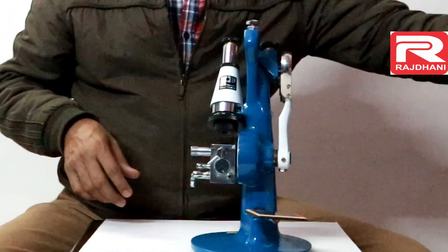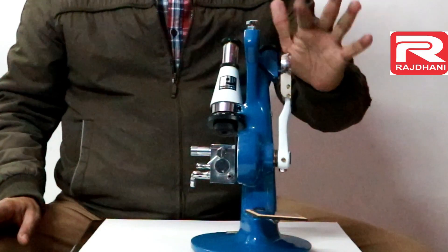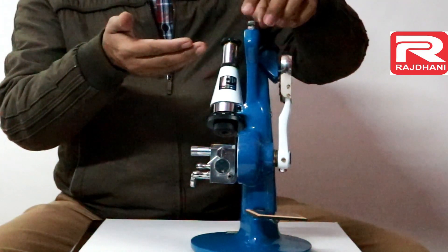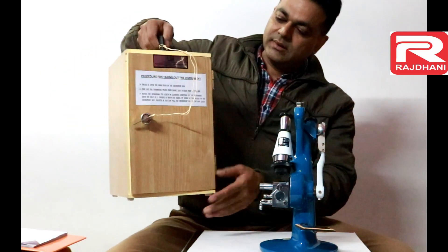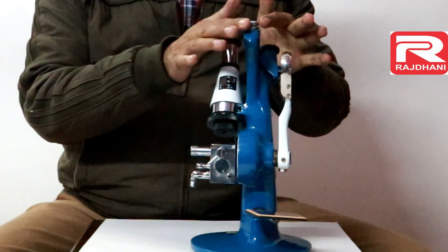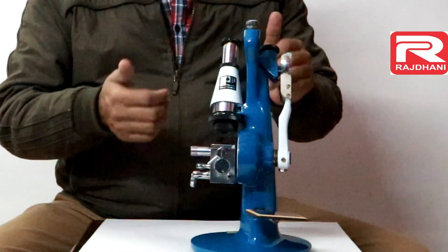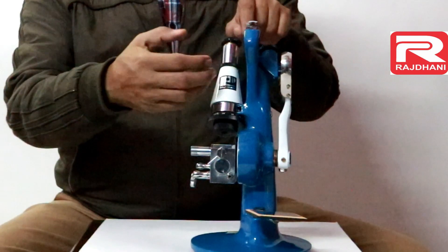Again reviewing the parts: this is the prism box, this is the conical shape eyepiece, this is the scale knob, and this is the scale. On the top there is a hexagonal bolt used for packing. When I unscrew this bolt you can see the height of the instrument increases. When packing, we lower it down and keep it inside the instrument case. While opening or taking out the instrument from the box, rotate this hexagonal bolt clockwise so that the height of the instrument is reduced and you can easily take it out.